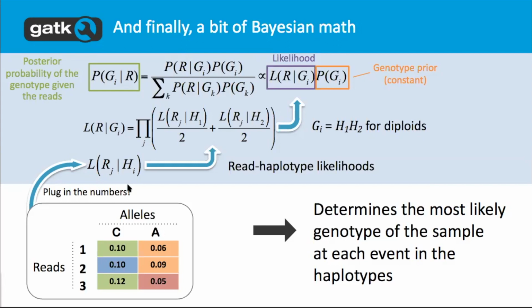The key thing you want to know from this part is that the modeling process takes ploidy into account. So by default, we're assuming that you have a diploid organism, and the model takes that into account right here, because we're looking at the two possible alleles that you might have within a diploid organism.